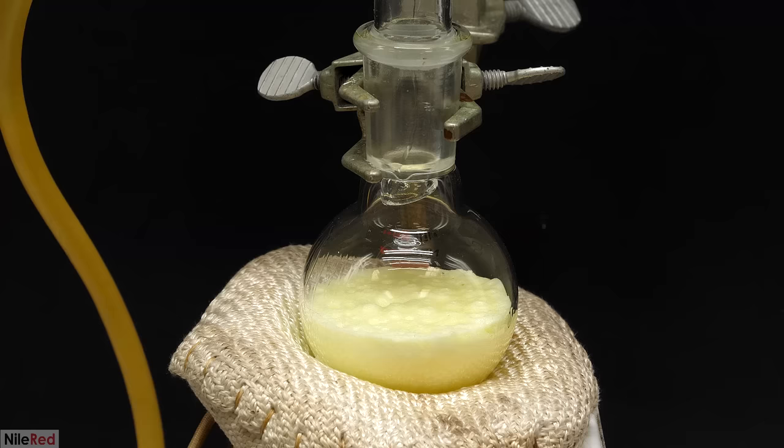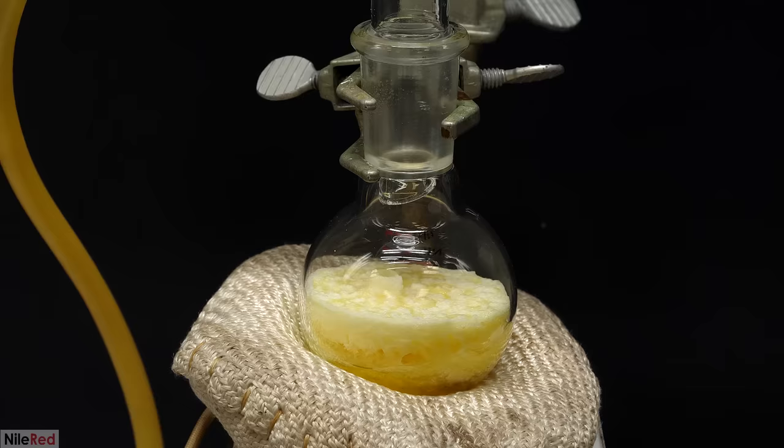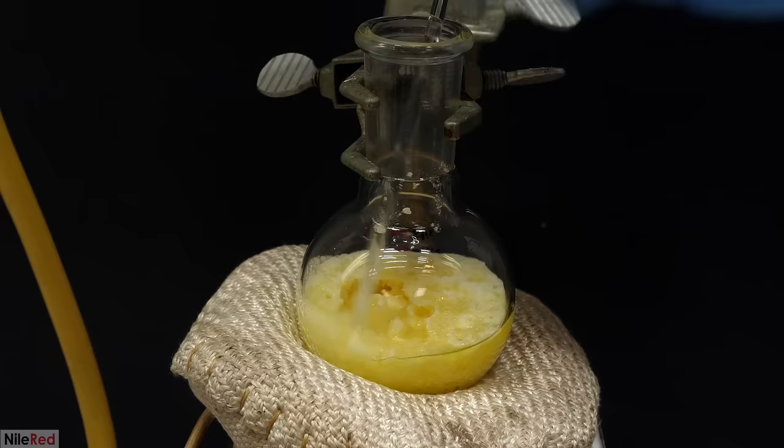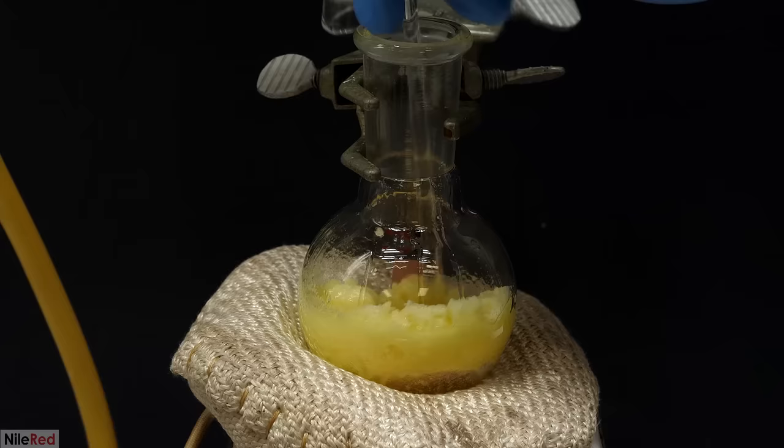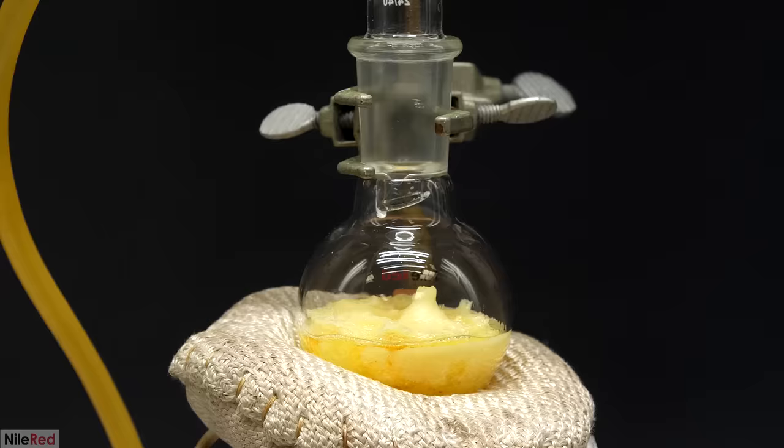The reaction that was happening here was exactly the same as what was happening before, I was just using heat to push it to completion. At around the hour mark, it looked like it was really getting jammed up with a lot of solid, so I took out the condenser and tried to break it apart. It kind of worked, and it gave me a more uniform slush, but I don't really think that this was that necessary to do. In any case, I boiled it for another hour, and then I took away the heating mantle.